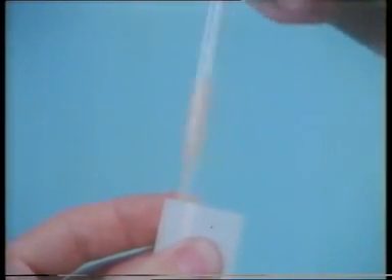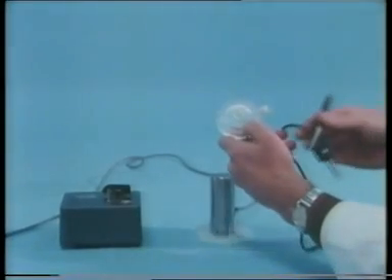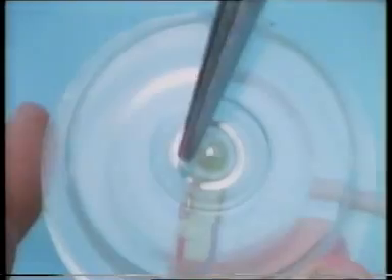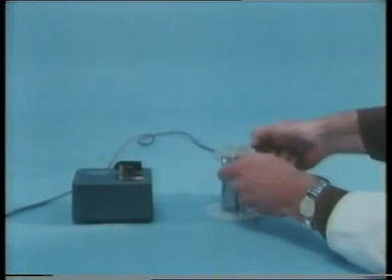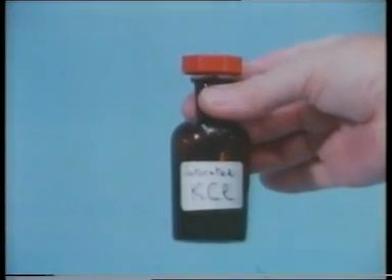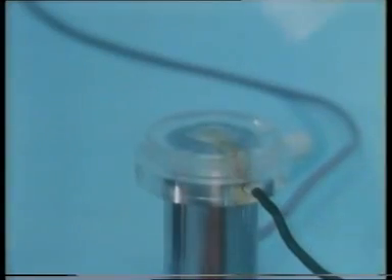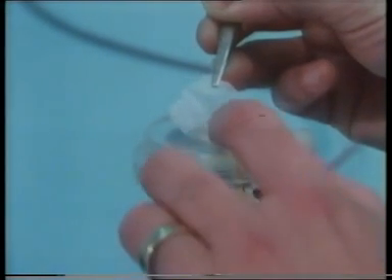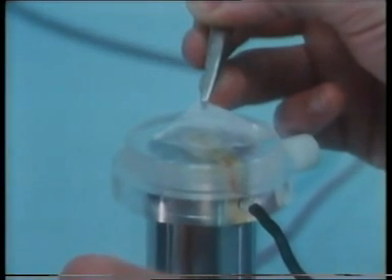This is the preparation we shall use in our experiments. We're going to use an oxygen electrode in our investigations. Here's the electrode assembly. The anode is this silver ring, and in the centre there's a platinum cathode. The assembly is mounted on the pillar of a magnetic stirrer. Saturated potassium chloride solution is dropped carefully into the well containing the electrodes. Now a piece of tissue with a small hole in the centre is placed carefully over the electrodes.